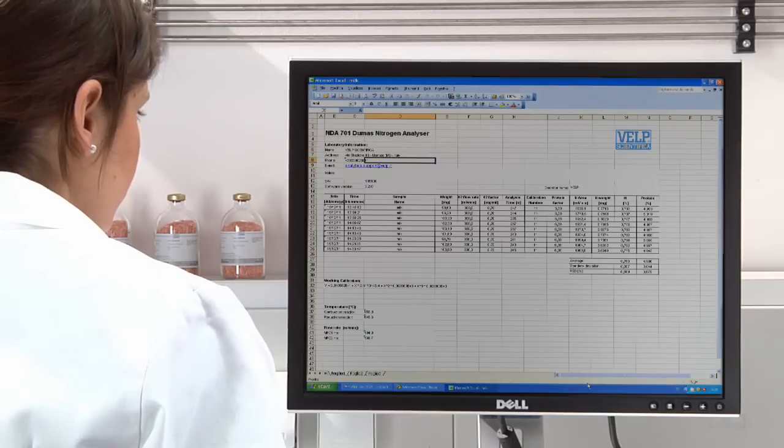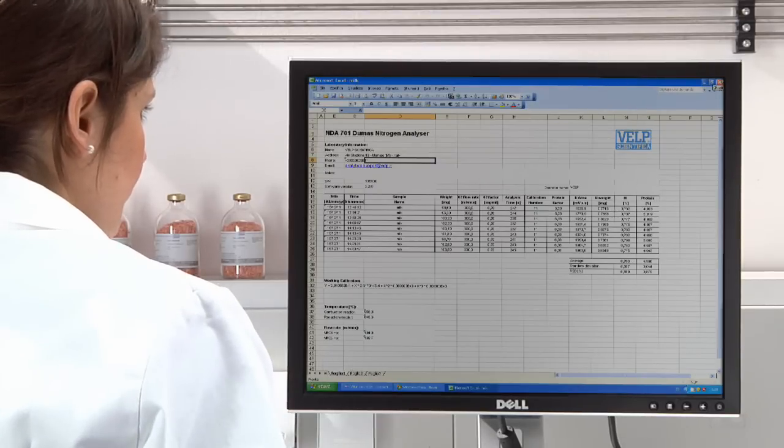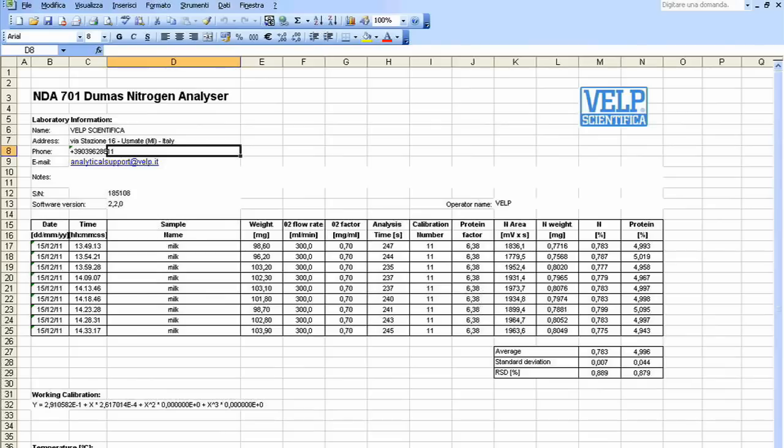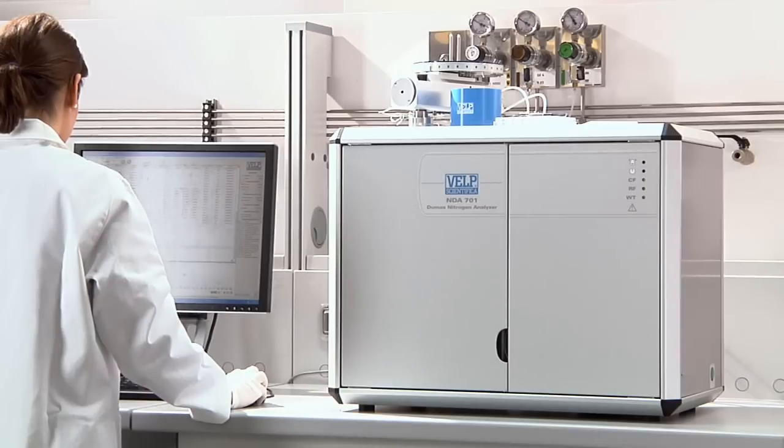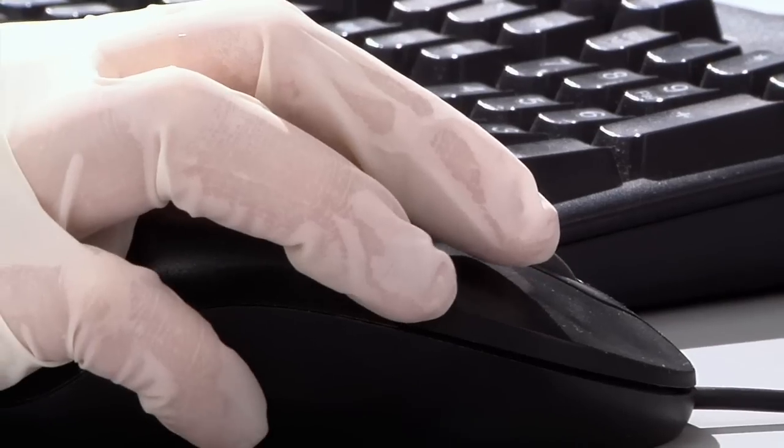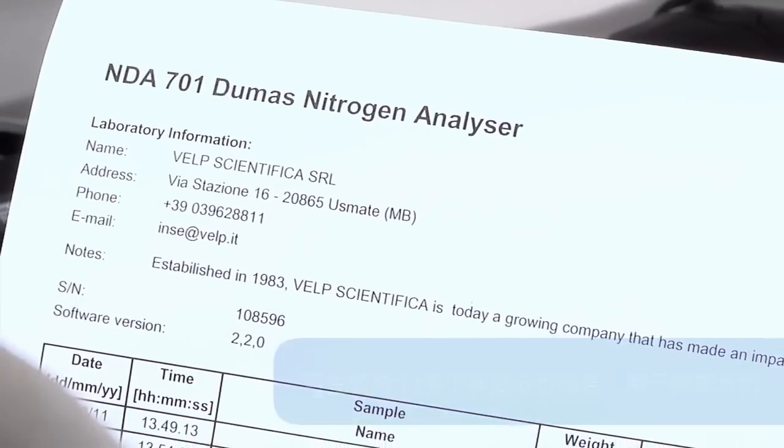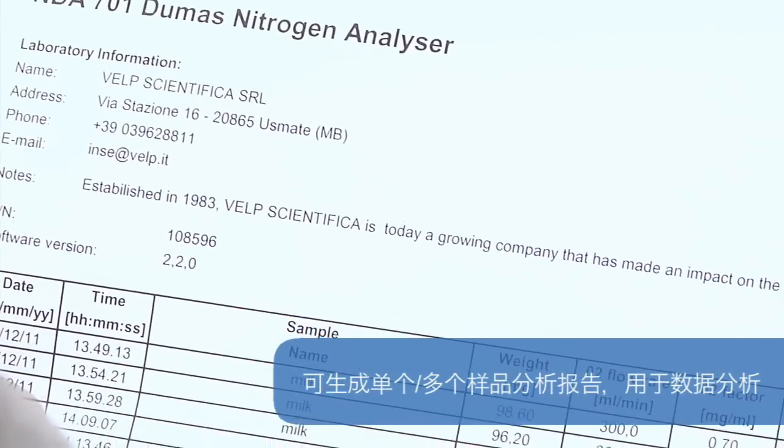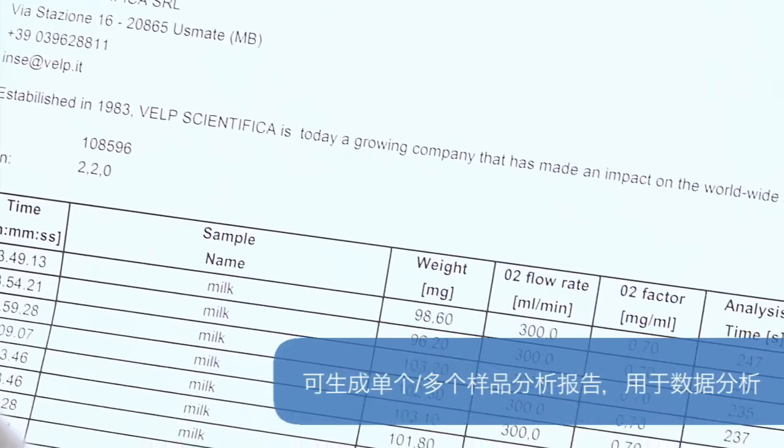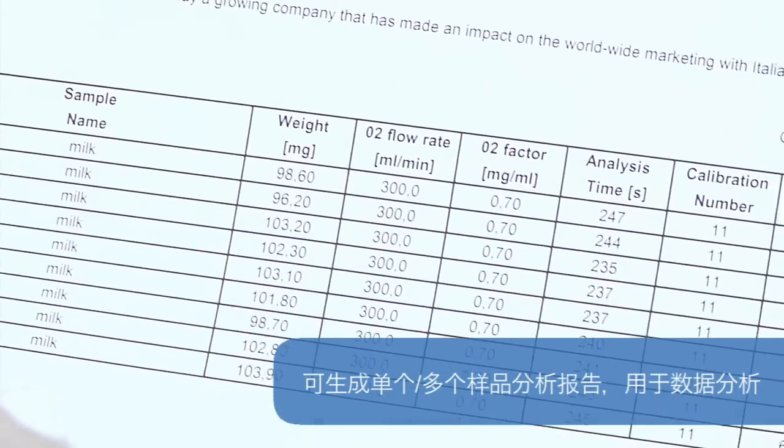A versatile reporting system can be configured to suit the user's preferences, and data can be output in XLS, TXT, and CSV formats for compatibility with LIMS and the company's standard software. The operator can also create test reports for a single test or multiple analyses for better interpretation of the data. All results and reports can be output to a printer or saved for GLP compliance.